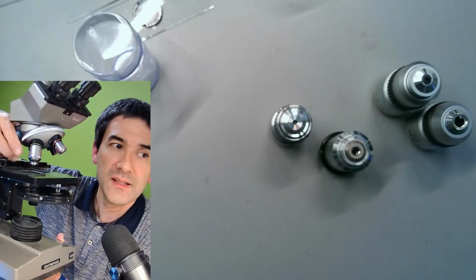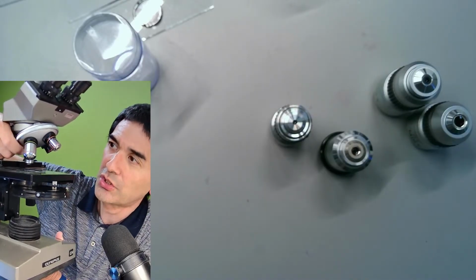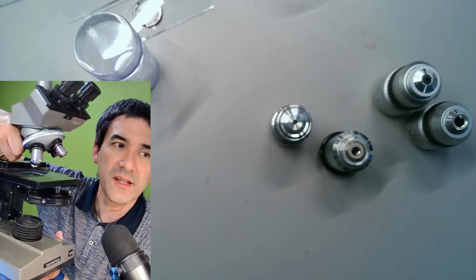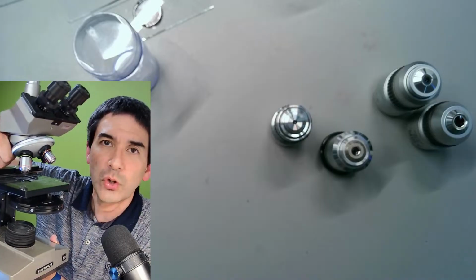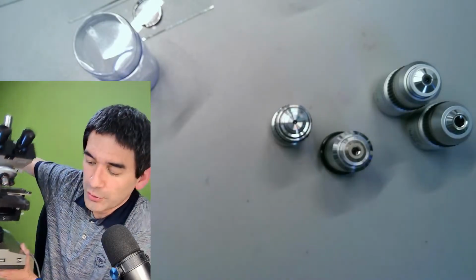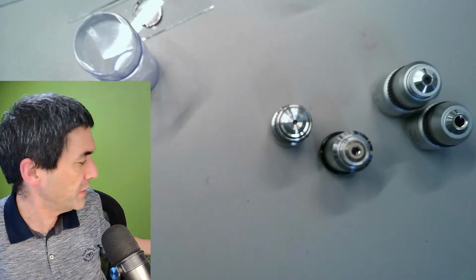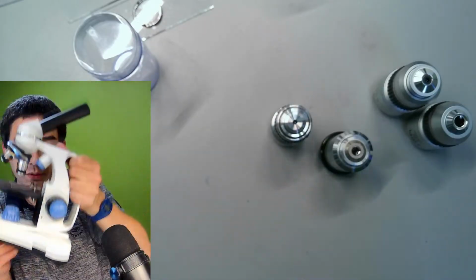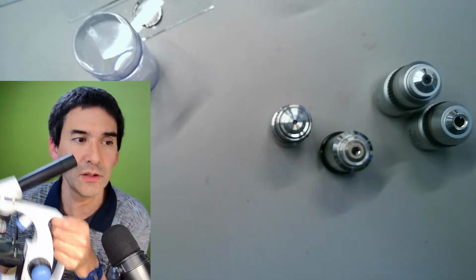But the thing is that the distance now is large enough that I am now also able to insert larger objectives. So you see that it's kind of semi-compatible. If I want to, I could upgrade this microscope here with larger objectives. That's kind of nice. But I cannot upgrade the small microscope over here with larger objectives, because even though it physically would fit and probably also optically would fit, there's not enough space down here.